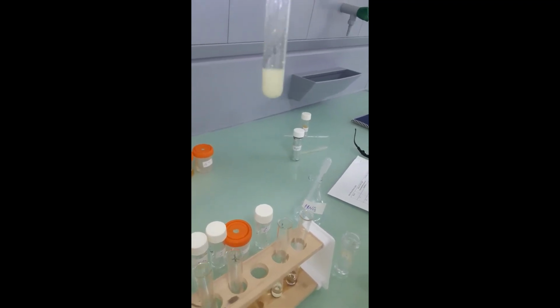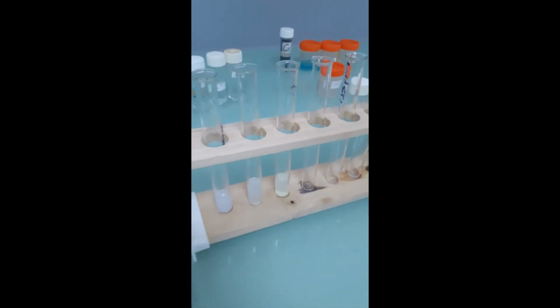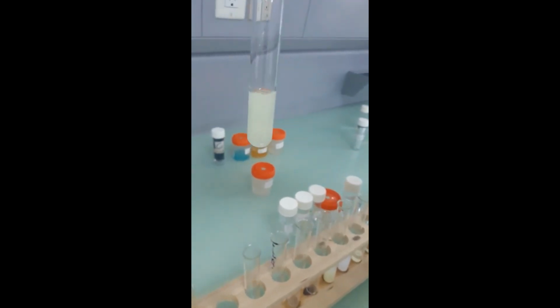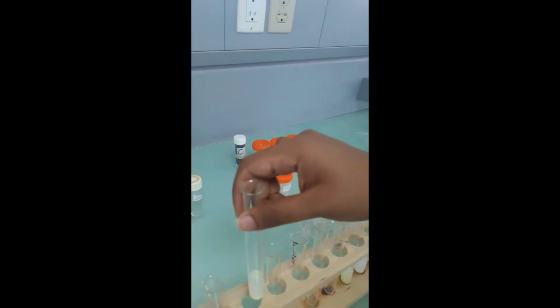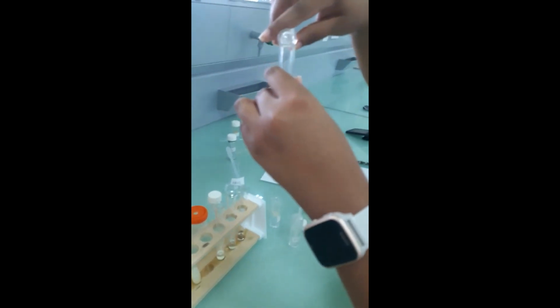And then we're going to add nitric acid into the other half. Now we're going to divide the SO3 2-, the sulfite ion, into two parts.